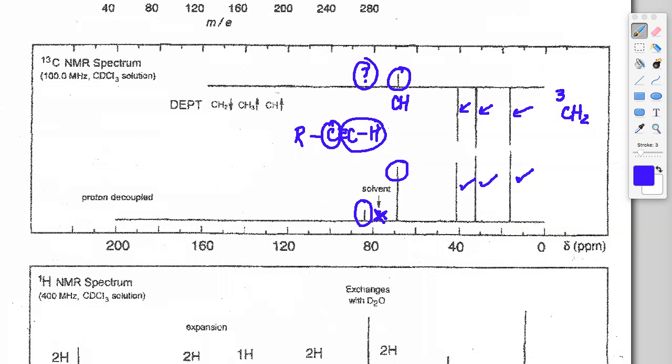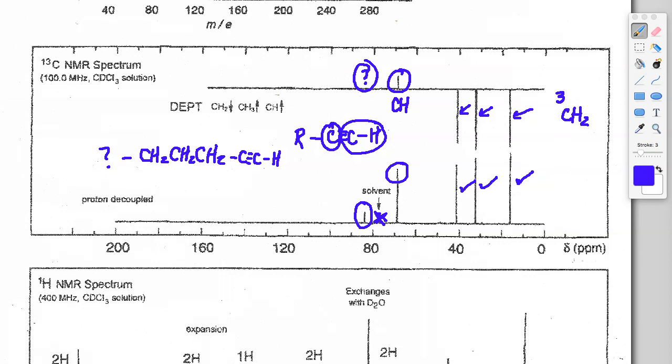All right, so what we have here now is a bunch of CH2s, and we also have most likely the making of this alkyne here. So when we put all this together, we could suggest something such as CH2, CH2, CH2, and then the alkyne is on one end, most likely terminal from all the evidence we've seen, and then there's something else over here because we can't terminate with the CH2 on the left side of that chain. So now might be a good point to go back and check the degrees of unsaturation and the formula to make sure we're lining up and see what's left.